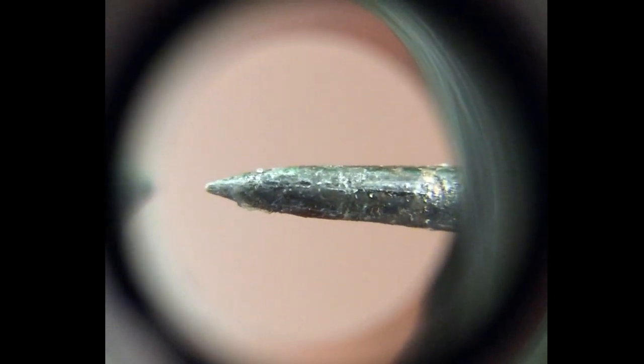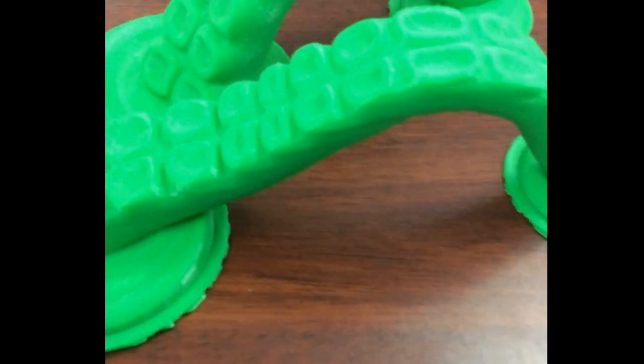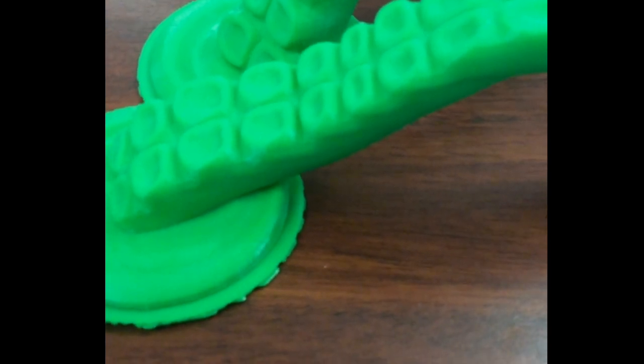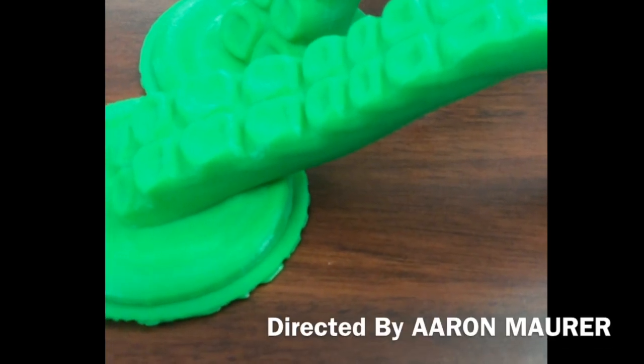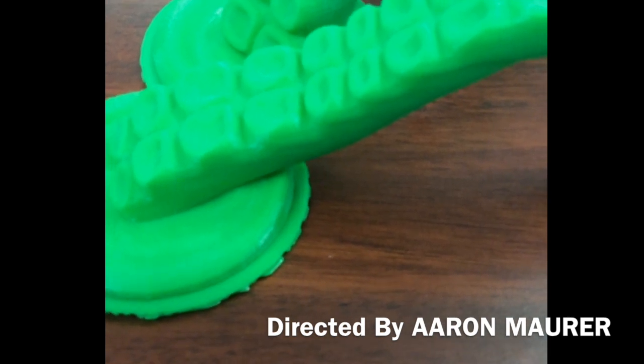It's pretty darn cool what you can do. These are just some examples. You can pop the microscope off if you just want a regular view and keep the grommet on. Right there is the iPad stand I was zooming in on earlier, and the grommet on the outside doesn't really bother things too much. I'd like for you to show me how you could use this in your class — some possibilities and ideas. Let's do some exploration. I'm going to go see what I can develop for a science curriculum at our middle school. Have a great day, and if you have any questions, leave feedback in the comments or reach out to me on social media.